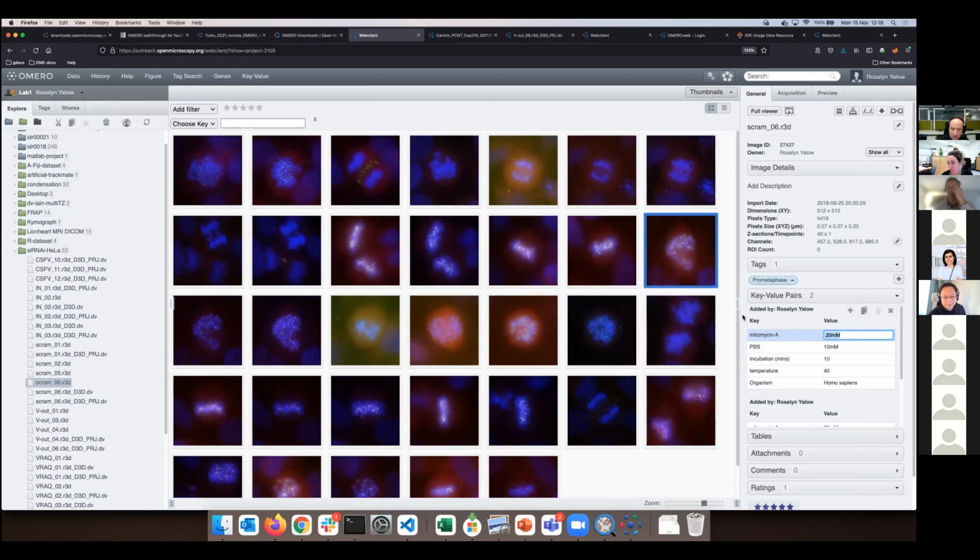Okay, and in this way you can type in the new information, creating new rows in this key value, and say, whatever, Turku, and the value is special, or the value is beautiful, okay, or maybe dark in this date of the year, and you know that the value of Turku is dark. It's very silly, but nevertheless, can we come up with something better?